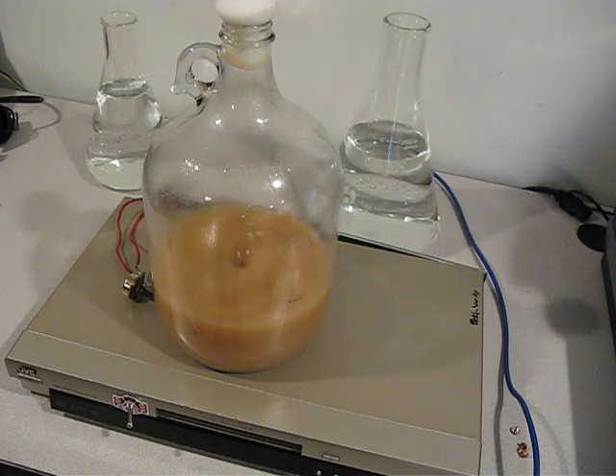This is day two of stirring. I made this yesterday around 11 o'clock in the morning, and it's about 7:30 in the morning the next day. When it started stirring yesterday I didn't have a vortex, but you can see I have a vortex now. I'm not entirely sure why — maybe it was thicker before. It's not going all the way down to the bottom, but it's stirring pretty well.